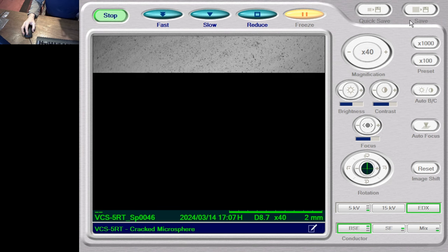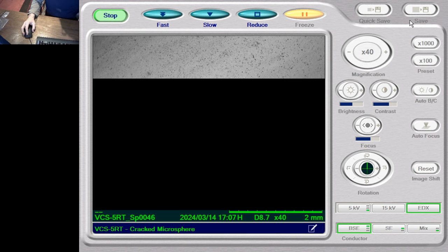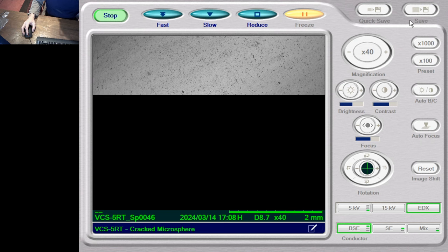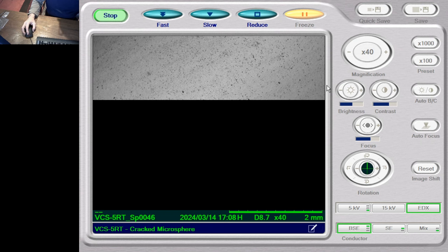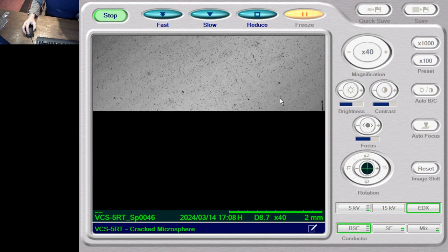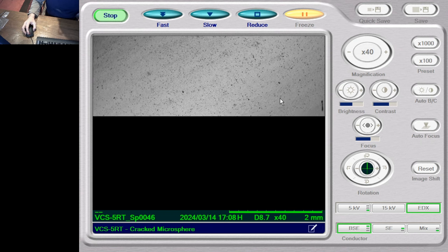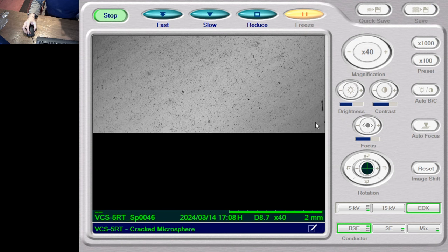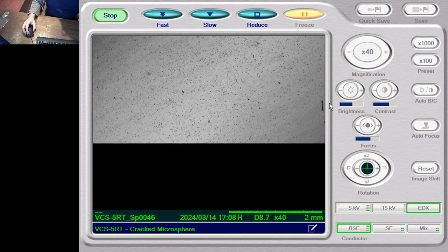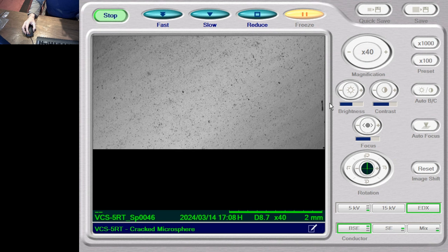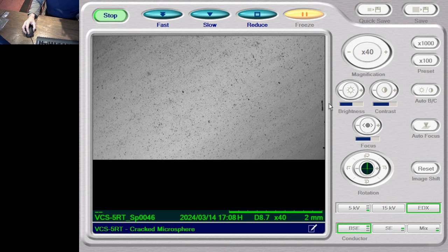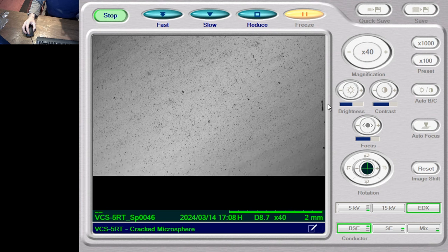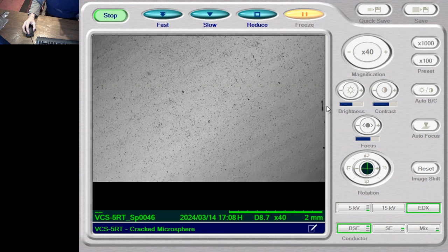That gives us an opportunity to see different elements as different colours. I imagine that the bulk of this is copper oxide, which because of the copper is bright — it is the sort of light grey background. And there appears to be these darker spots, which are going to be lighter elements — lighter in terms of their mass.